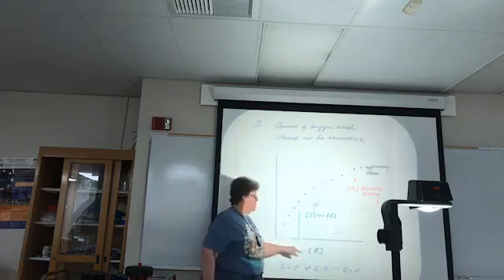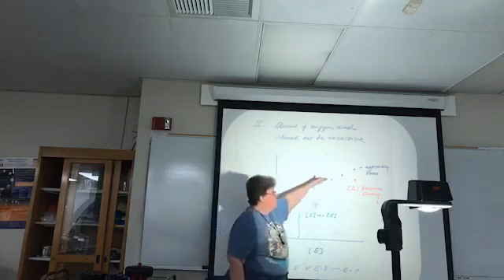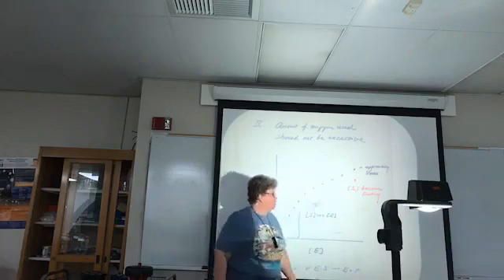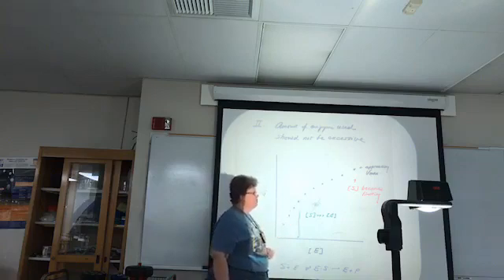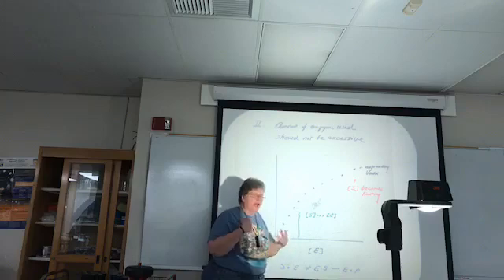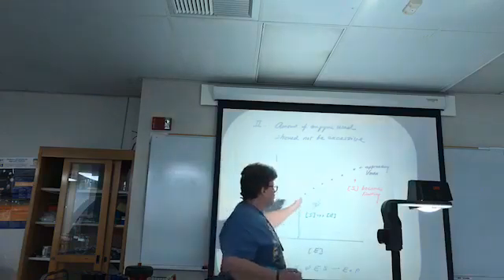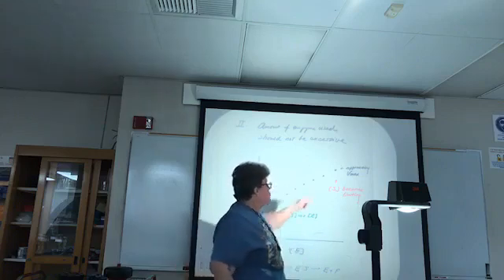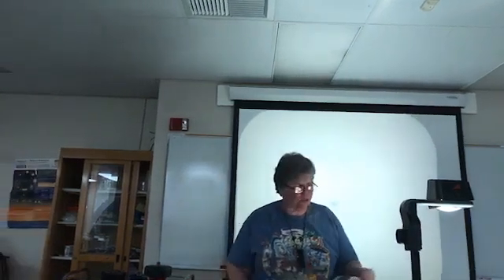And graphing velocity versus enzyme concentration, with 3 microliters or 4 microliters or 5 microliters, you should see the velocity increase. Maybe by the time you add 6 microliters, now you start to get some curvature here. And that curvature is what you see when your substrate becomes limiting compared to the amount of enzyme that you have in the reaction. So then you'd say, okay, at 3 microliters of enzyme, I'm still well within the linear range of velocity versus enzyme concentration. I'm not approaching a point where my substrate becomes limiting. So then for the rest of it, you say, yeah, 3 microliters is a good amount of enzyme to use.